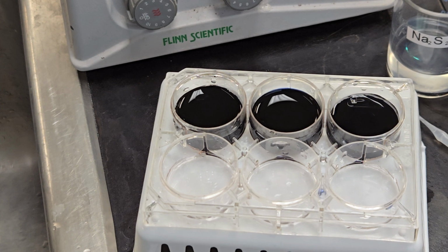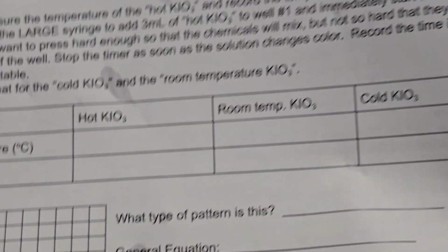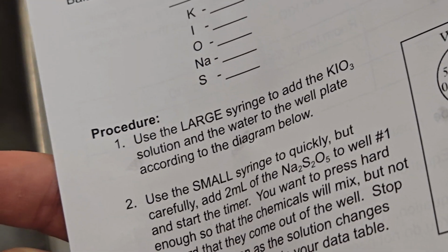There's your reaction. Again, if you measured to the split second the reaction started, that's fine. If you measured to when the reaction was complete and the full color change had happened, that is also fine. You should now have all your required data on the backside. Hot, room temperature, cold. The temperatures were the exact same as they were on the front.